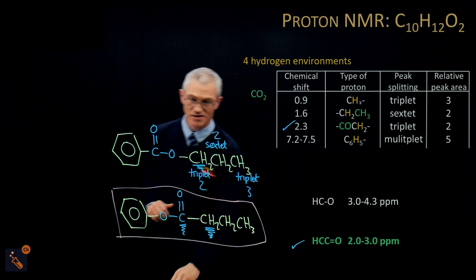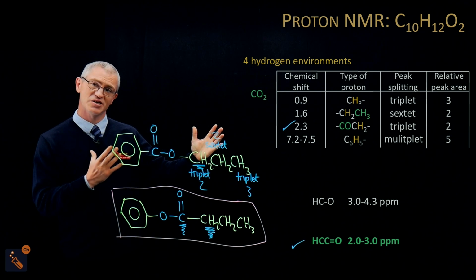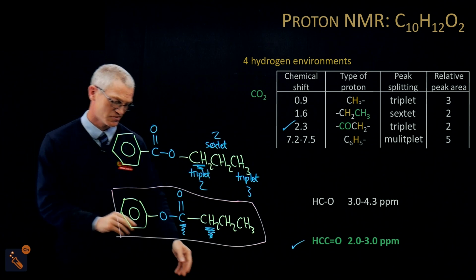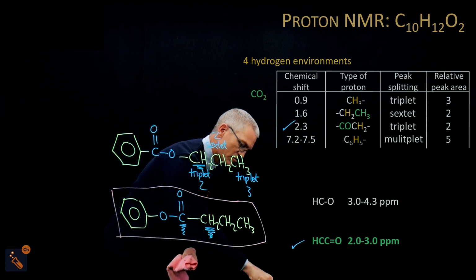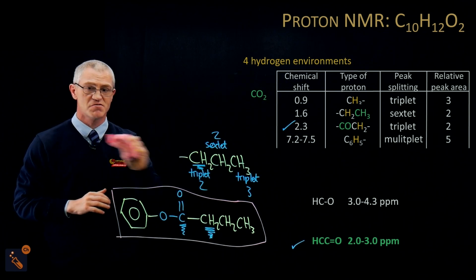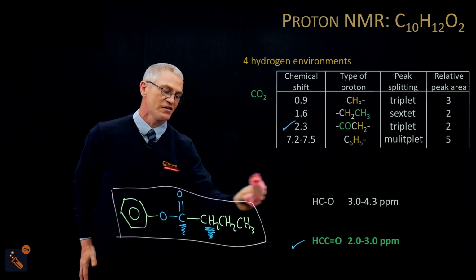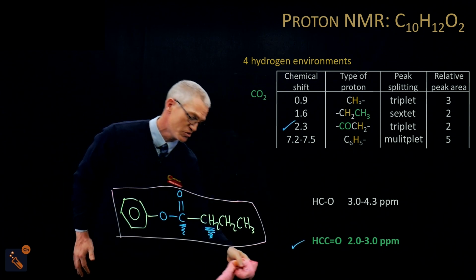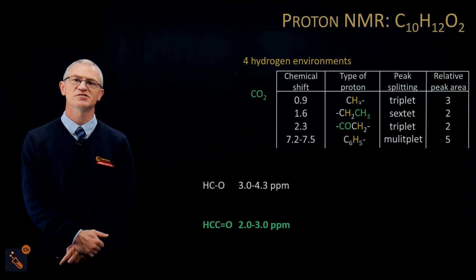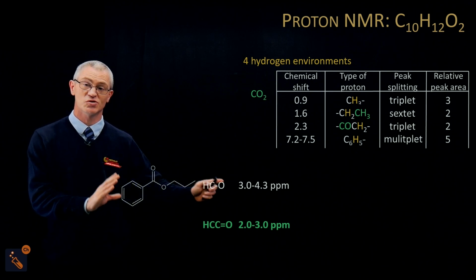So what I end up having is an unambiguous table, and I end up eliminating the wrong one. I'm just going to do that for you right now. Let's get rid of the wrong one. There we go. Which leaves you with the absolute correct one at the bottom and the correct isomer. Just to finish off this analysis, I wanted to show you what it looks like with the other isomer, what signal you will get.